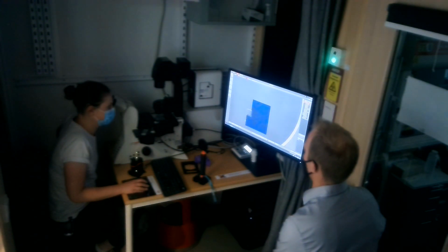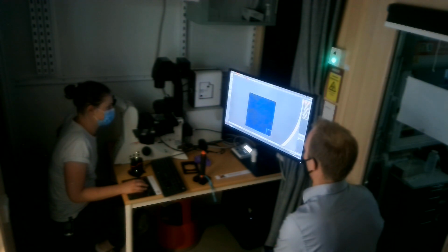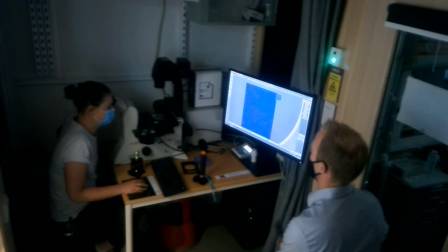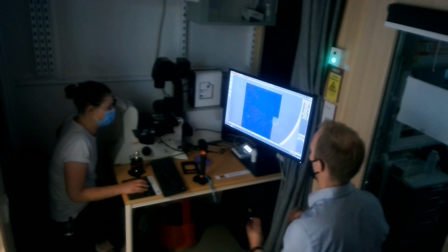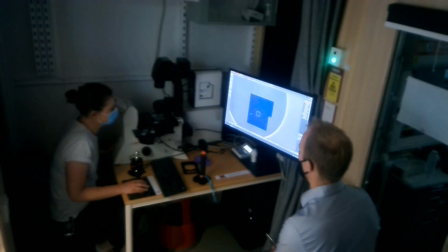And this will go until you say, that's all I need. And these kind of things, especially with your sample, you could easily do this with the 5x, and you would cover the whole thing in this period. You would have probably done the whole well even.